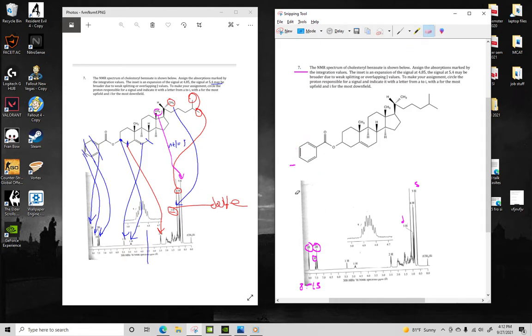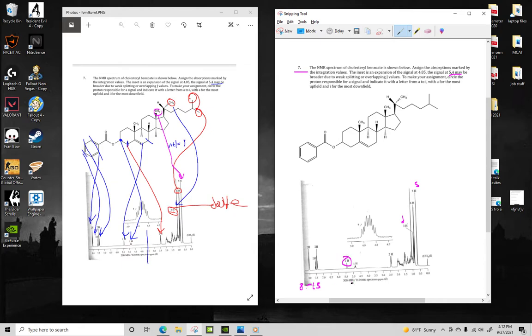All right, we'll move upfield. So this peak right here, in the question it says at 5.4, it may be broader due to weak splitting and overlapping. So it's actually a multiplet. It looks kind of misleading, but it's not a singlet.